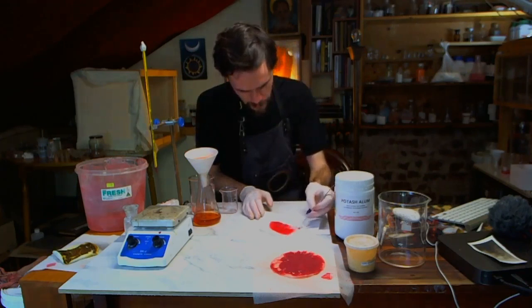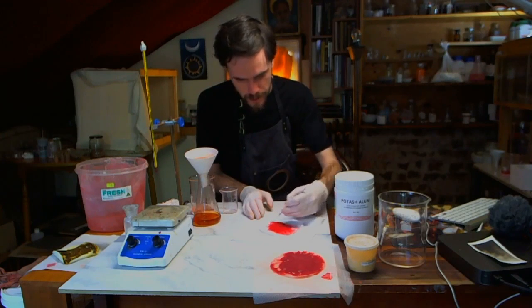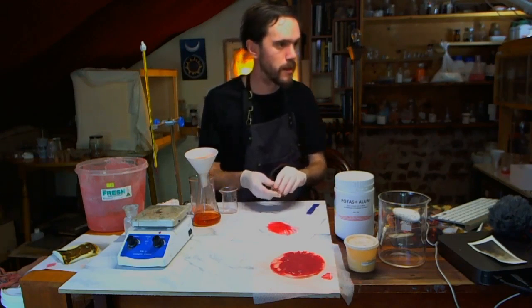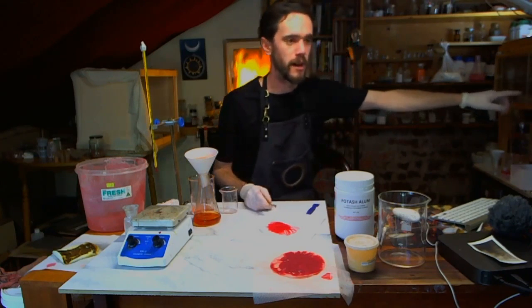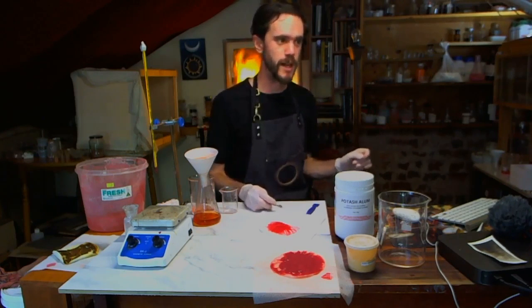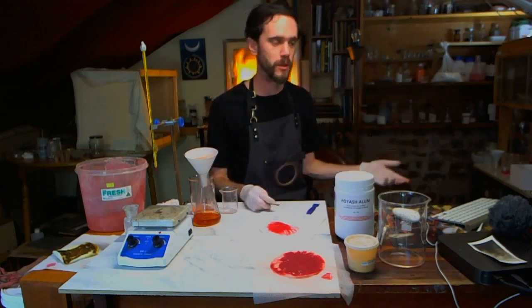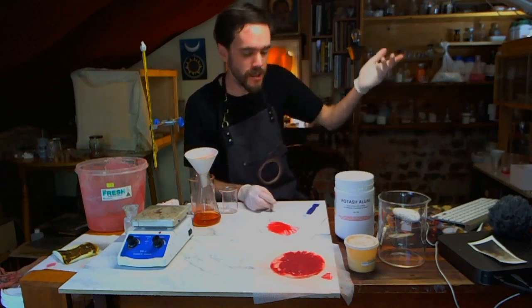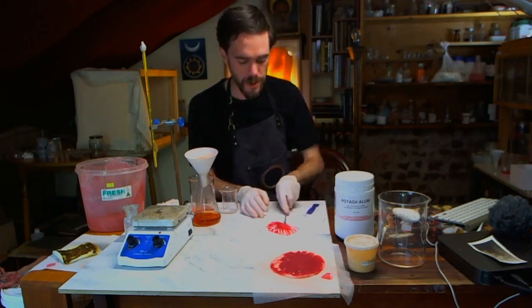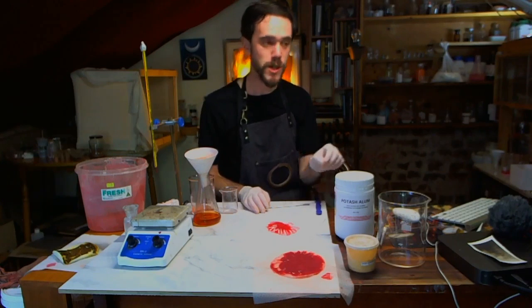Okay, so we're just collecting what we recovered from the cotton wool there. The fume cabinet there, yes, I made it myself, so I don't trust it for anything really dangerous. But if I'm boiling any sort of acids, like hydrochloric acid, or heating anything where I think any sort of fume coming off could be potentially bad, I do it in there because it's definitely preferable. I would never trust it completely, but I trust it enough that it helps.